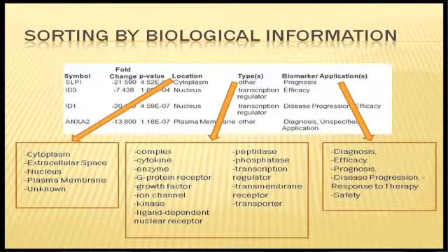And say we know it's a G protein receptor, but we don't know what it is. We can look at this too. You can just look at all your kinases, ion channels, enzymes, cytokines. If you're studying some kind of infection, obviously the cytokine group might be interesting. You might want to look at that just by itself. Again, this is just ways of chopping down the mountain.